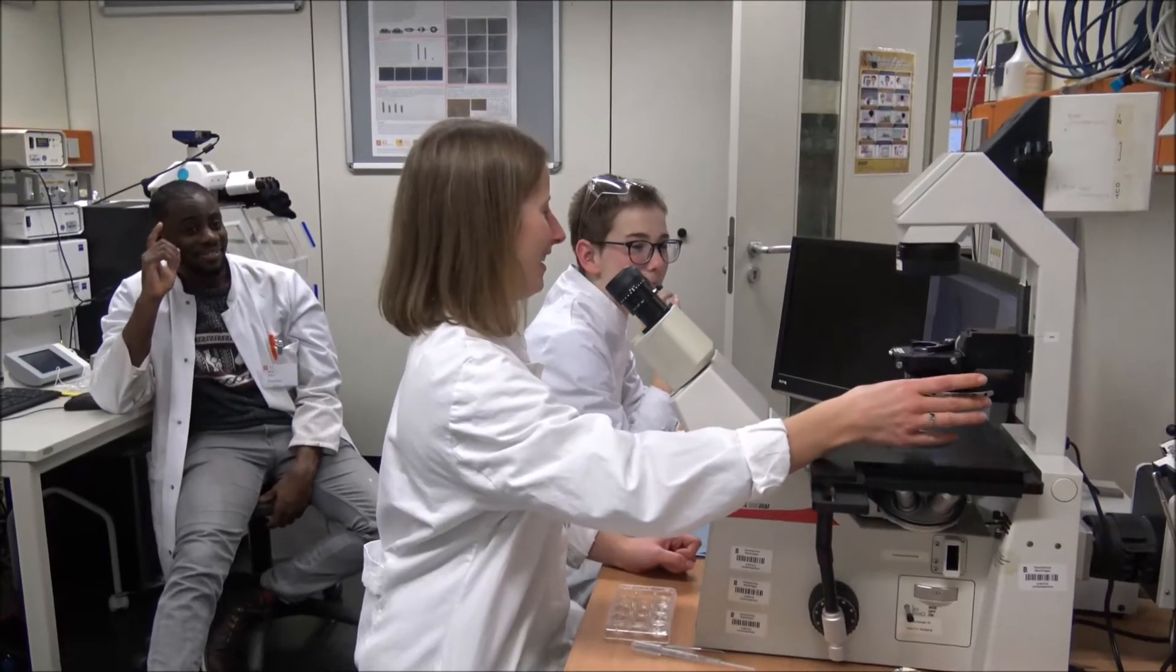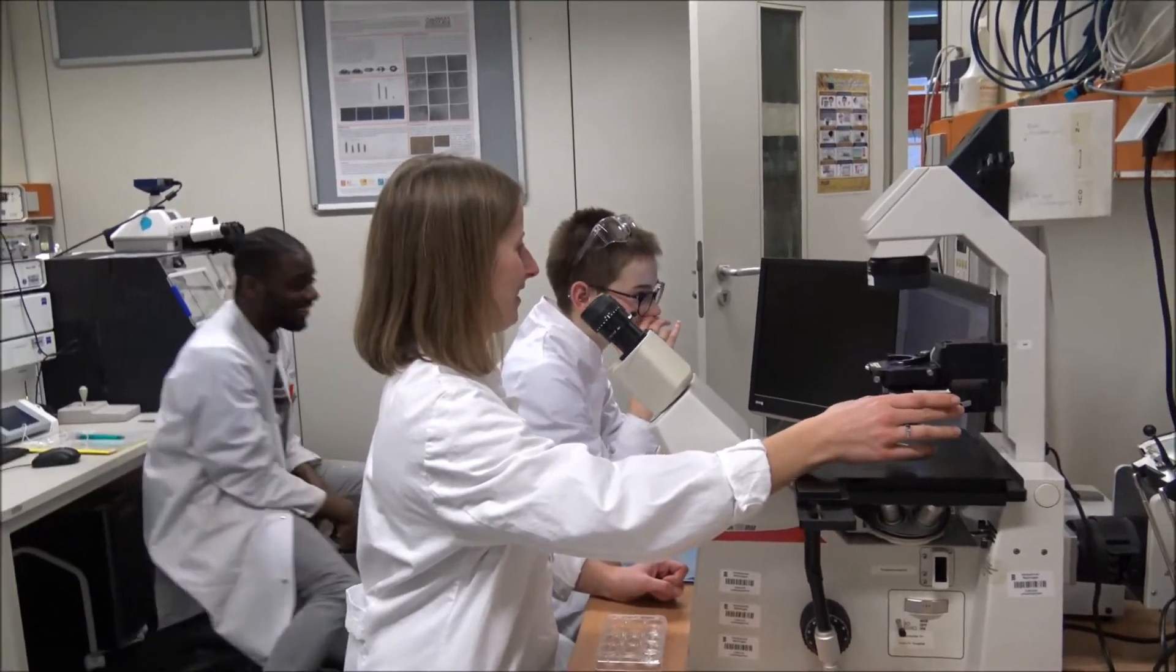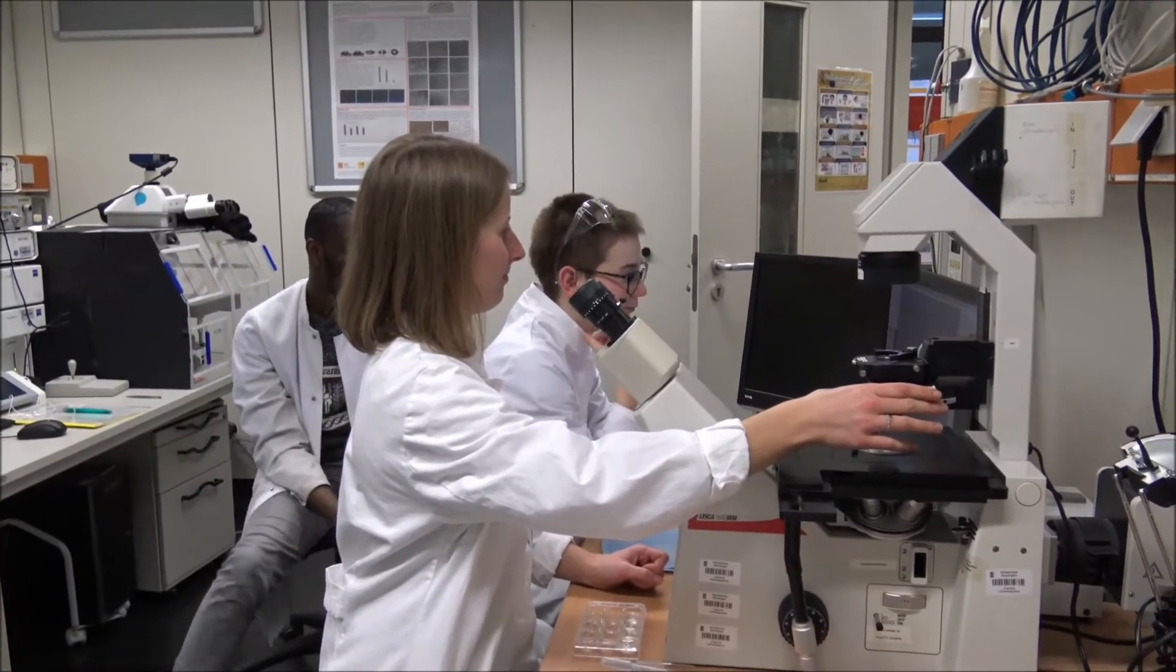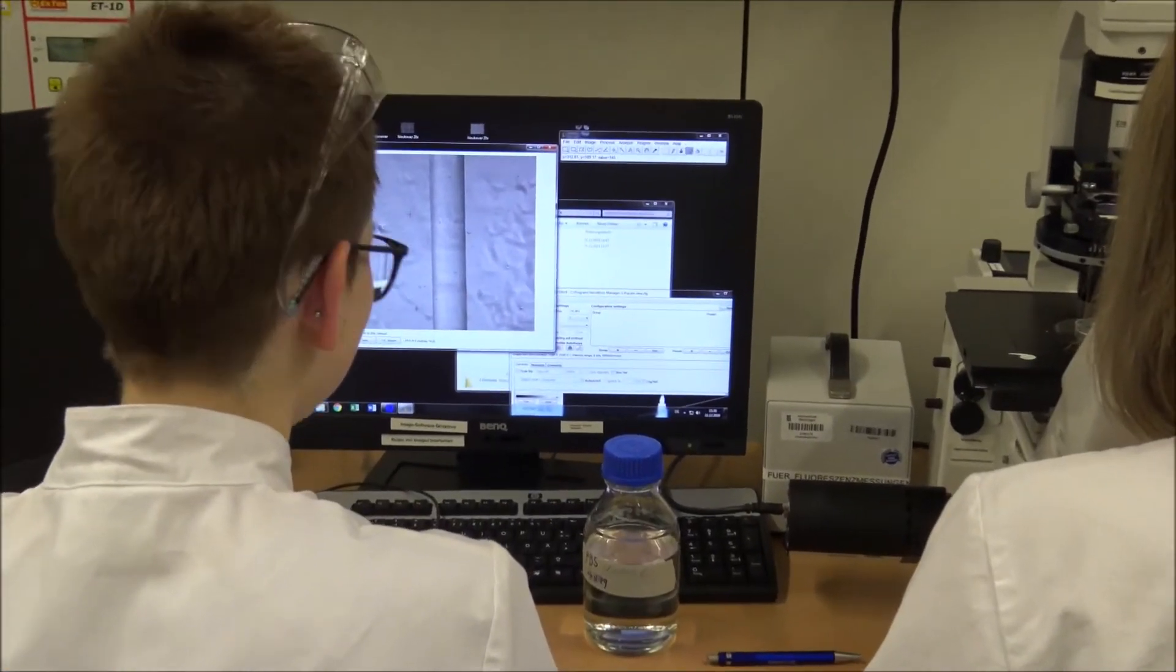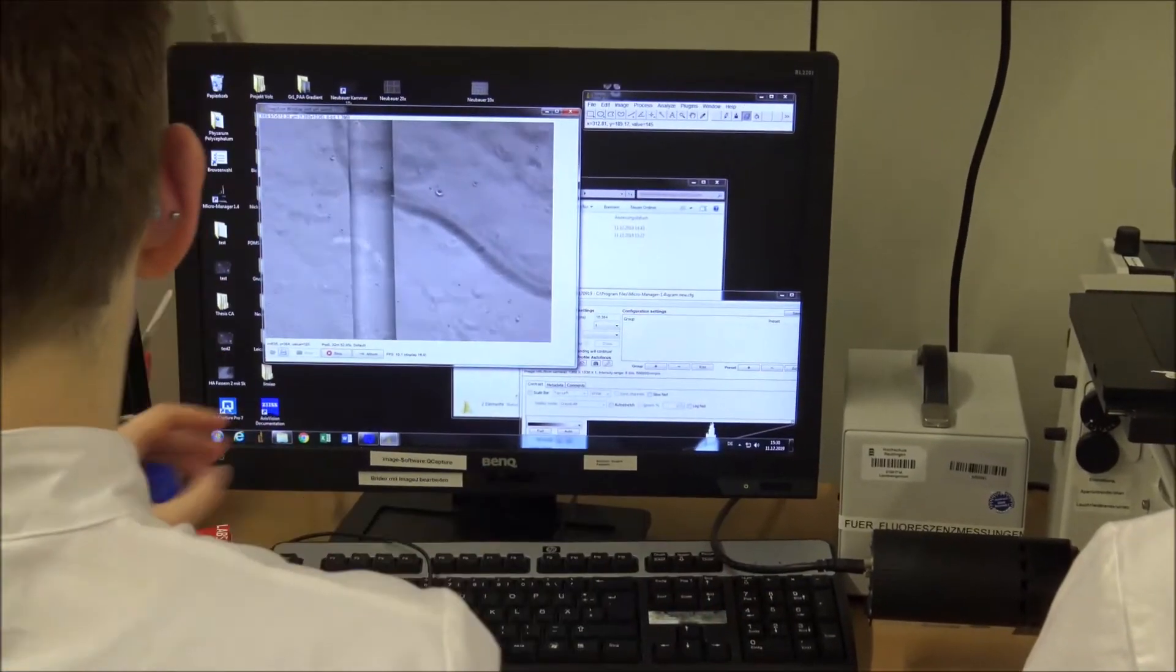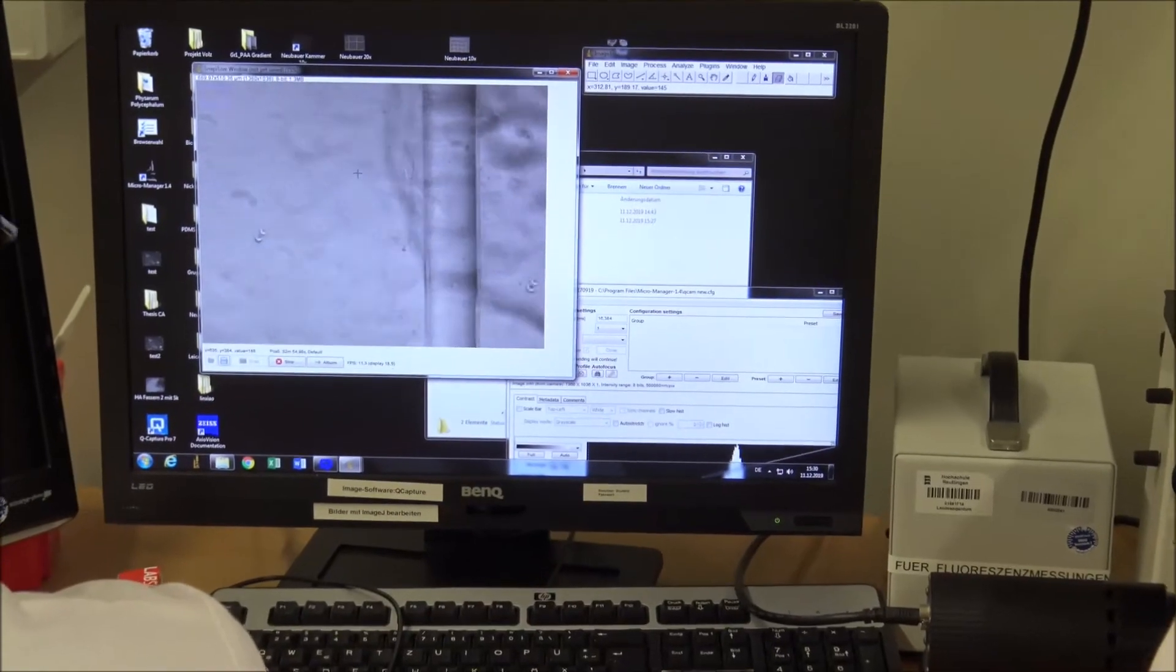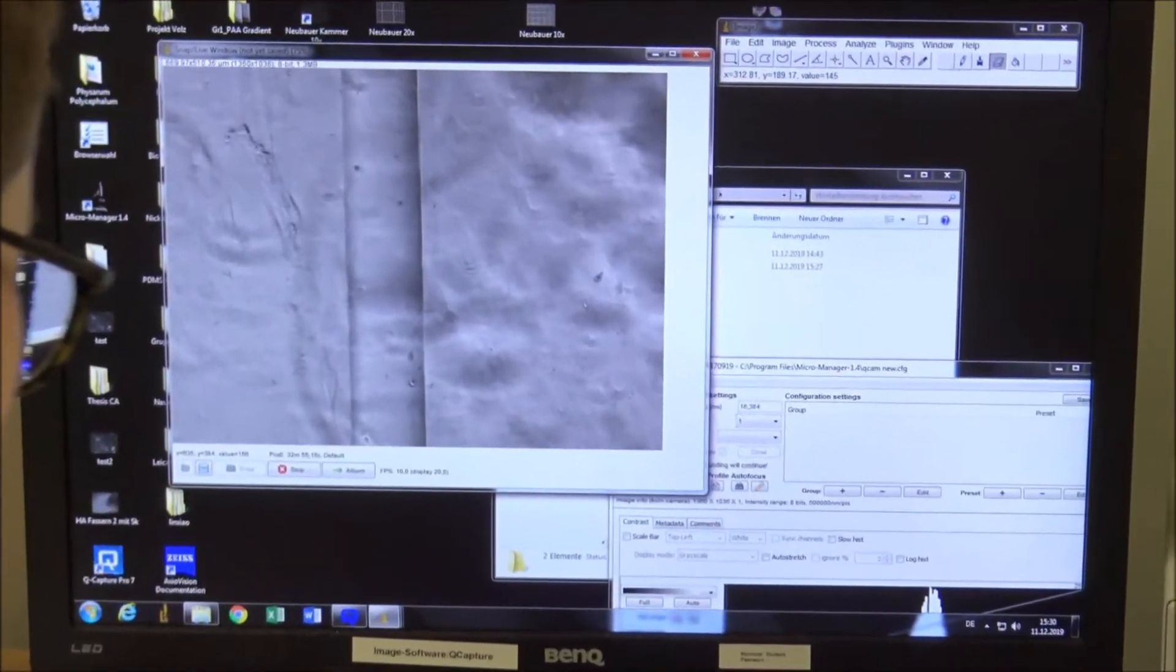After one, three, and five days the cells were fixed to take microscopic pictures in phase contrast. To investigate the influence of the curvature radii on the cell orientation, the angle of the cells to the curvature was measured.